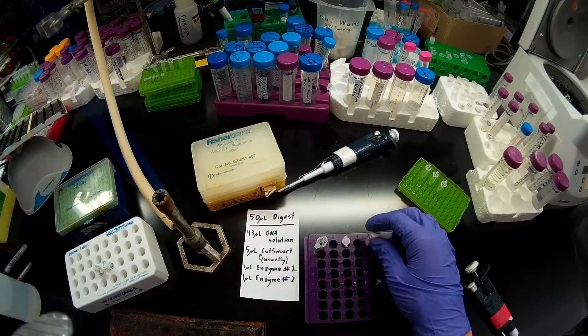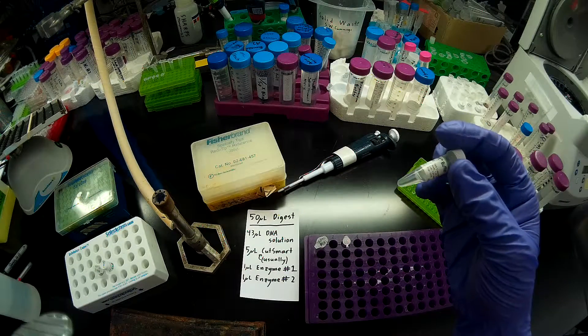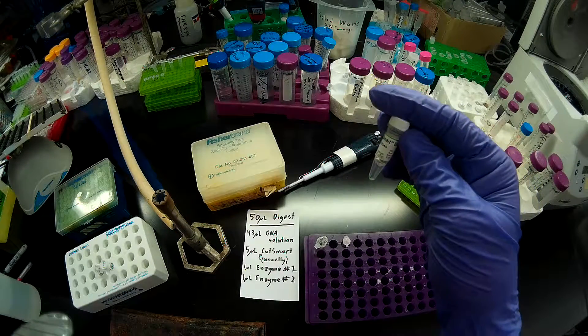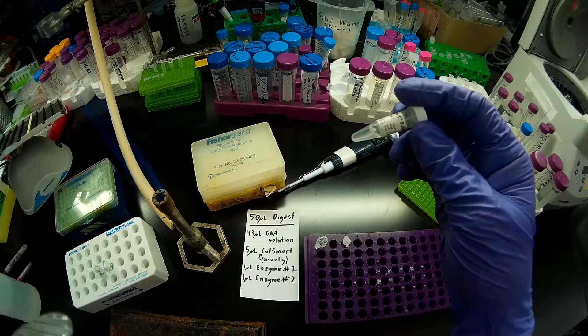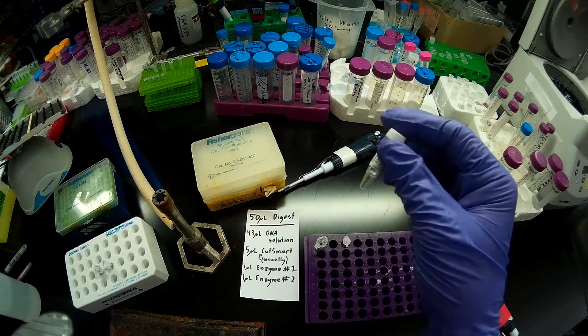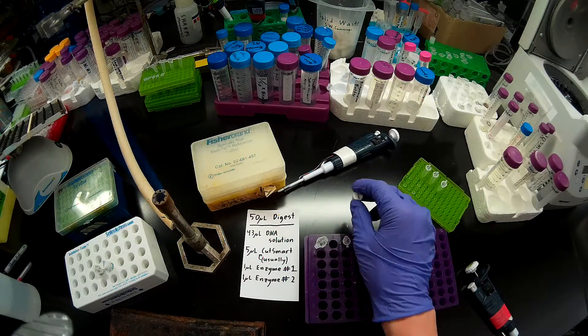I have CutSmart buffer here from NEB — I thawed that out beforehand. We want to make sure that it's very well mixed, because when you freeze CutSmart, a portion of the salts will precipitate out. You want to make sure those are all re-suspended. I vortexed this earlier and then spun it back down, so that should be good.